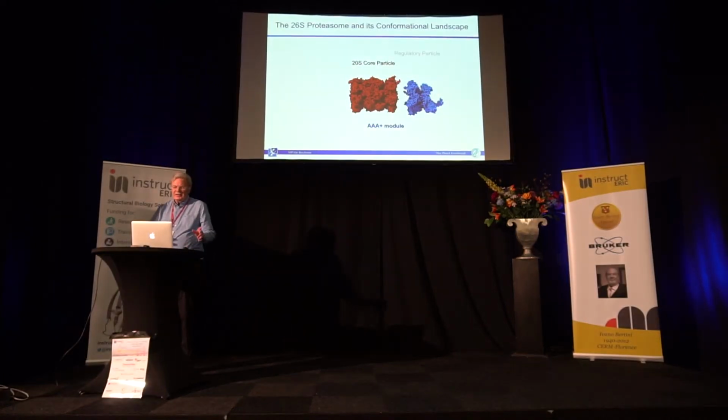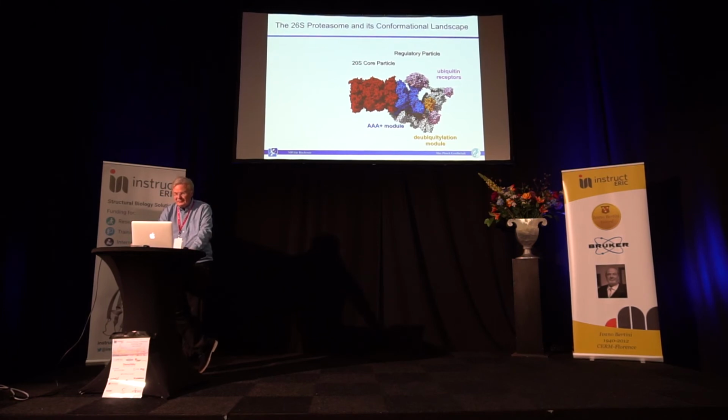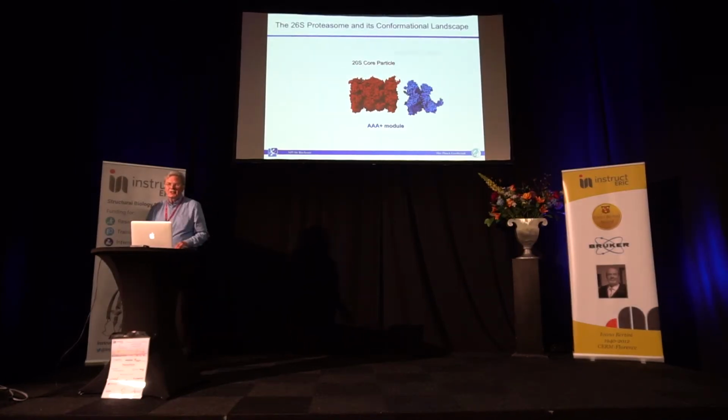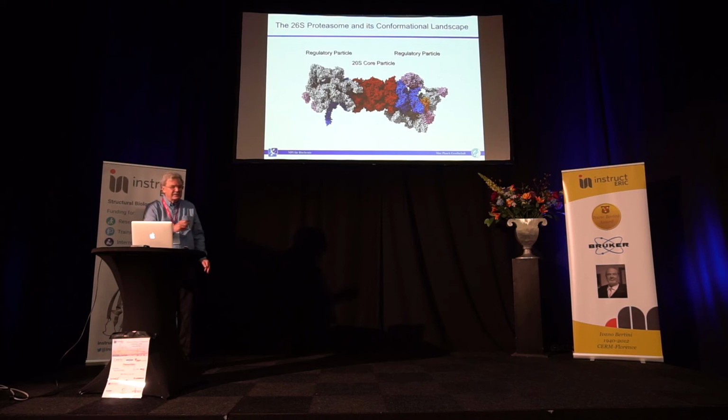Now, before I go back into proteasomes in situ, I need to say a few words about the basic architecture. I need to introduce it. So this is not in situ data, obviously. This is data from single particle analysis. I think I better go back for a moment. So we have the core complex. That is where proteolysis takes place. It takes place in the cavity in the middle of the core particle, where the active sites, which are sitting on the beta subunits, are located.